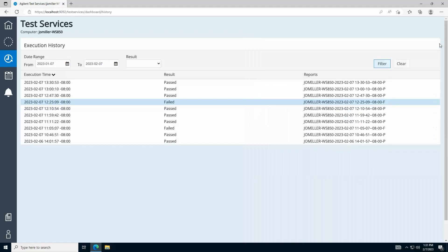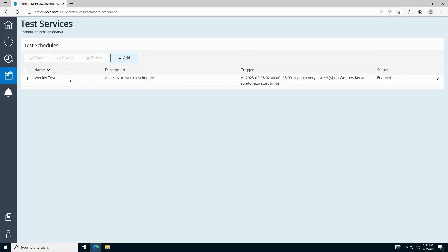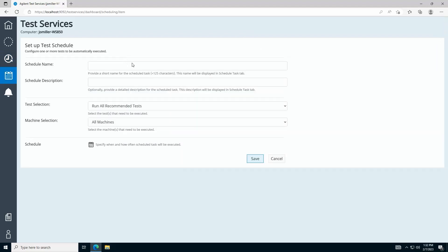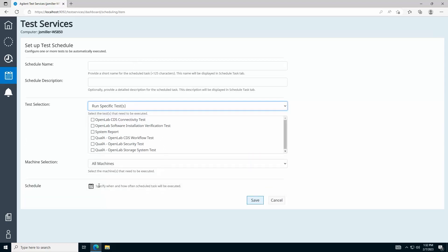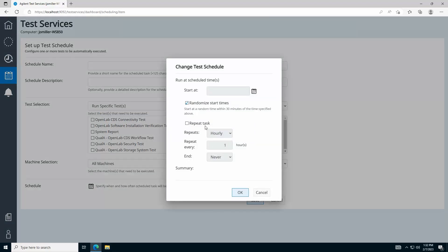The Test Schedules tab, found here, allows you to program automatic execution of selected tests and allows you to schedule recurring tests.